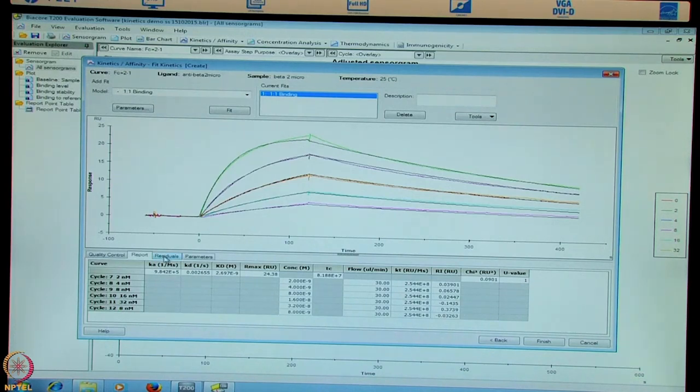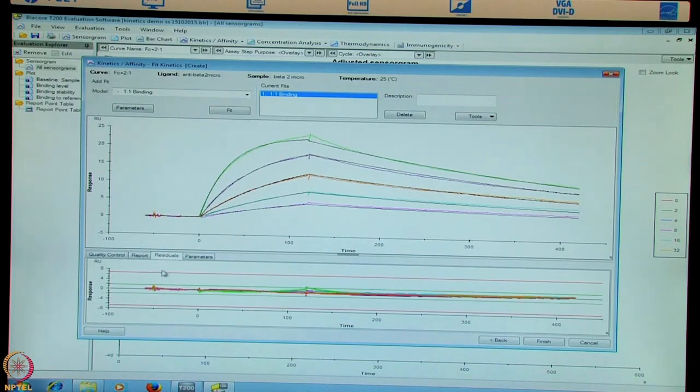We go to the next tab, residuals. The residuals should be aligned between the red lines, preferably between the green lines. And here you can see that the data is completely within green lines. And that indicates the superimposition of the black lines on the colored lines is very close.